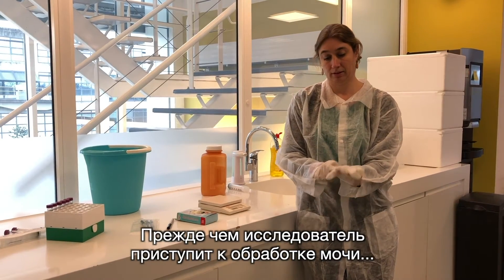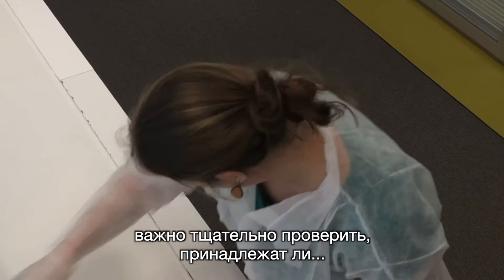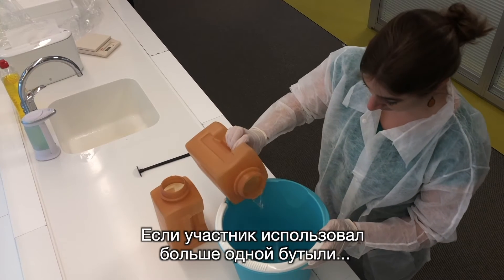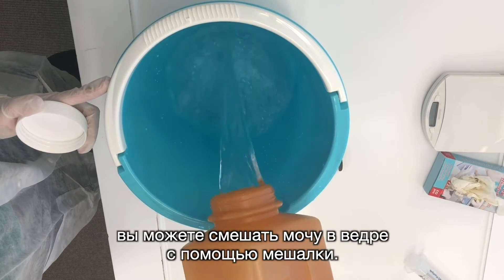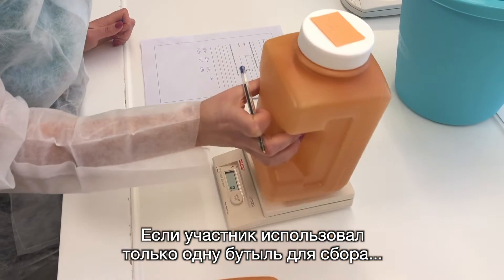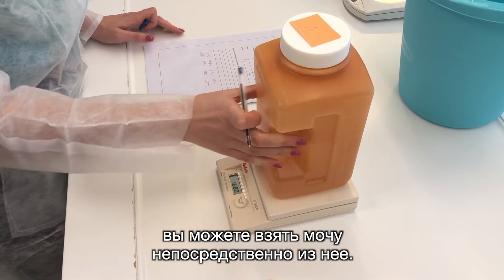Before the researcher starts processing the urine, it's important to check carefully whether the test tubes and bottles belong to the same participant. If the participant has used more than one bottle, you can mix the urine in the bucket by stirring with the stirrer. If the participant has only used one collection bottle, the urine can be taken directly from this bottle.